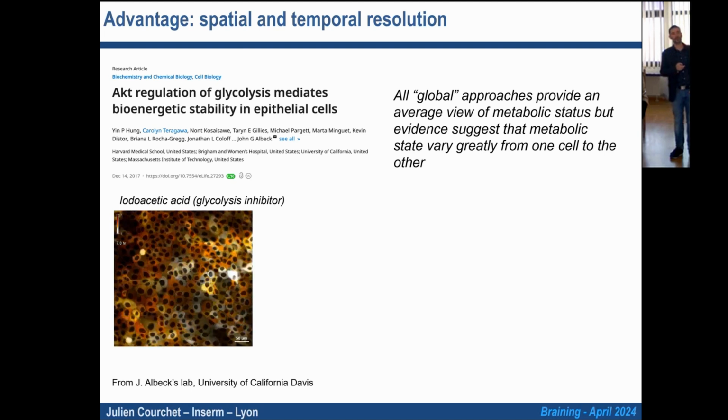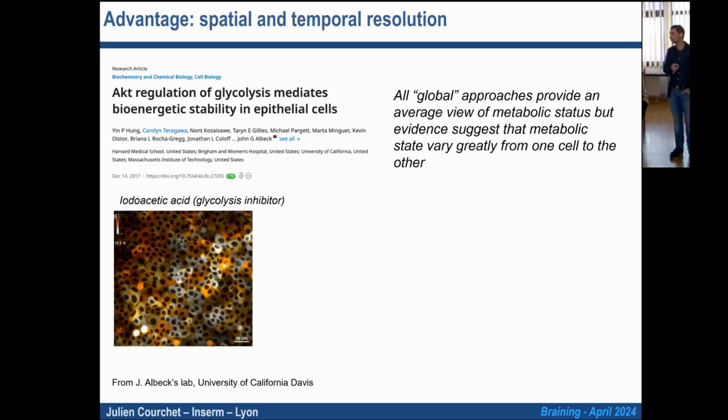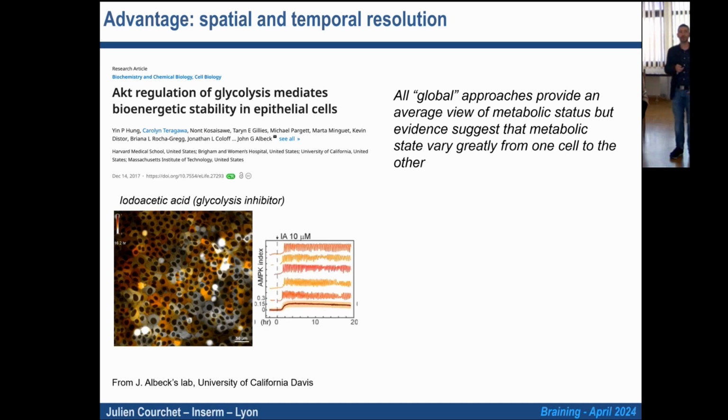And he will put the inhibitor here, but what you see is that actually the signal is not becoming red in all the cells at the same time. And also it's not staying red. Some cells will be pretty stable. Some cells will have those oscillations that you can actually measure one cell at a time, and you can see oscillations that are not always synchronous between all those cells. And depending on the quantity of drug that you use, you will see that some cells respond and some cells do not respond.